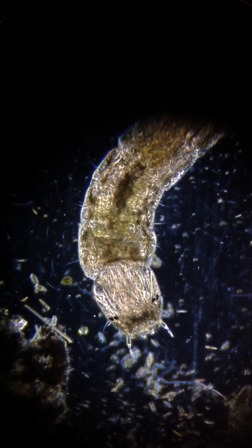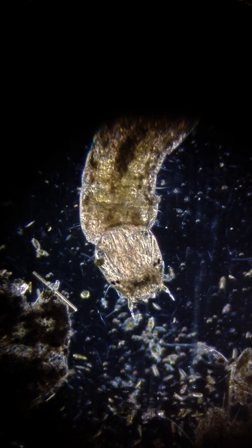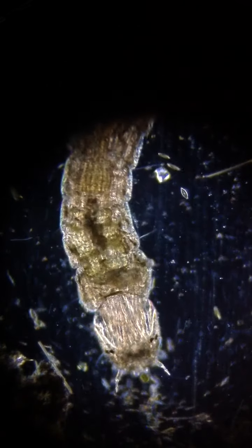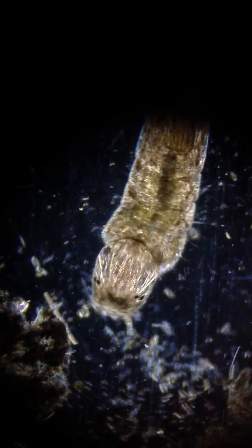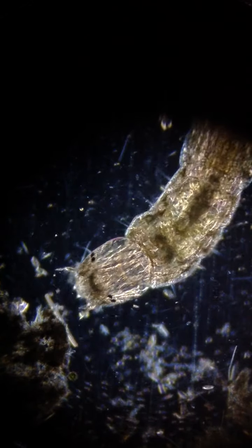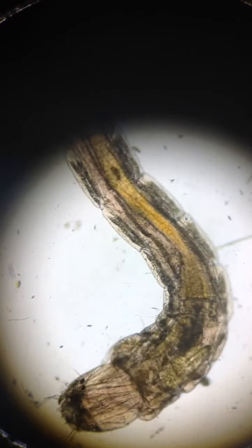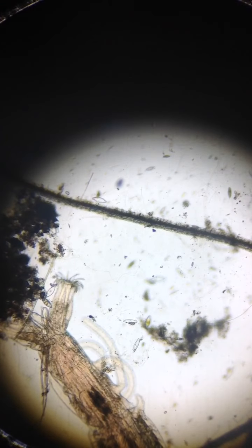So basically that's kind of it today. What I'm going to show you is simply to illustrate that occasionally it does pay a little bit to have a closer look at your camera. There is, however, a slight problem sometimes, and that is that you don't always have the full details of all the microscope cameras. For example, over here, I suppose it's a 0.5 times reduction optics, but it's not printed on here. And then also the sensor size I have to get from the website of the manufacturer.